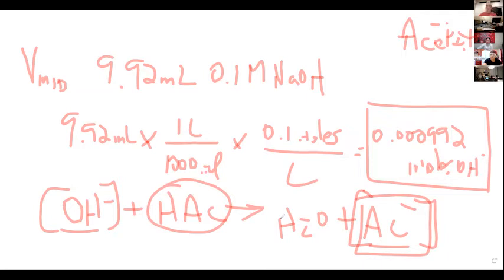So what is that constant? Let's figure out how many moles of acetic acid we had at the beginning.